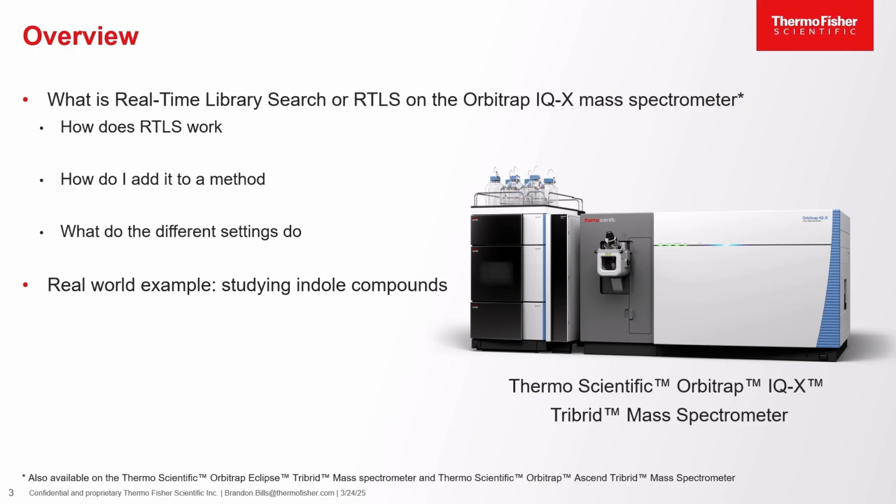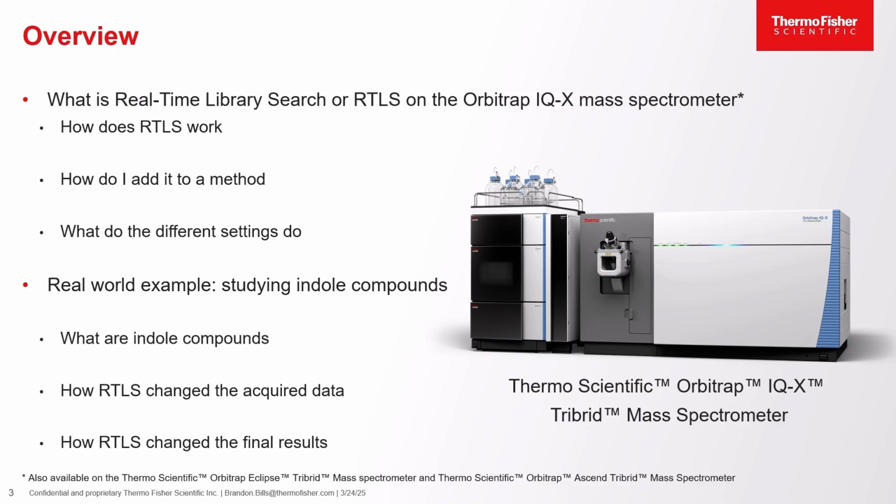Then we'll move on to a real-world example with one of our collaborators, specifically where we were studying indole compounds. That will include talking about what are indole compounds, how real-time library search changed the acquired data, and how real-time library search then changed the final results.